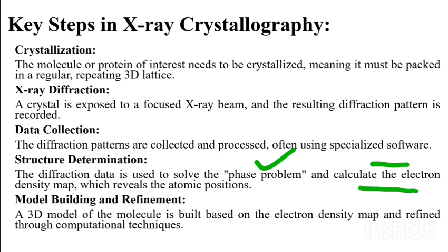Here only crystals are used because it is neither possible to see nor handle a single molecule by this technique. Crystals are used because inside the crystals a lot of molecules are present. A defining feature of a crystal is that it is a three-dimensional periodic array of molecules. All the molecules in the crystal occur in only one or a few orientations. This leads to a tremendous amplification of the diffraction image, and the diffraction image is also much simplified.